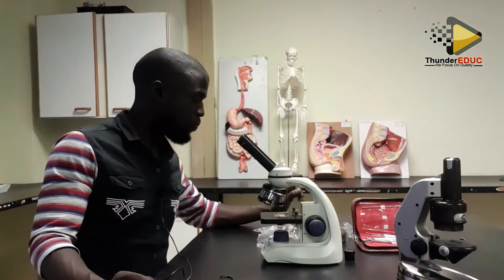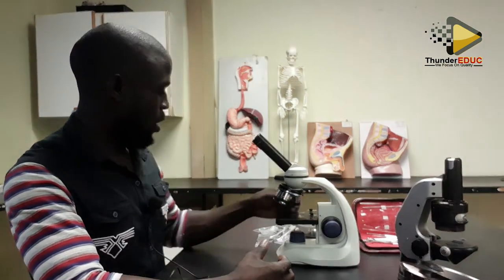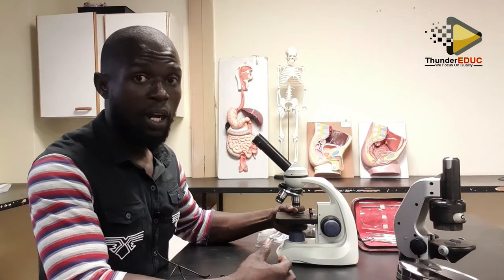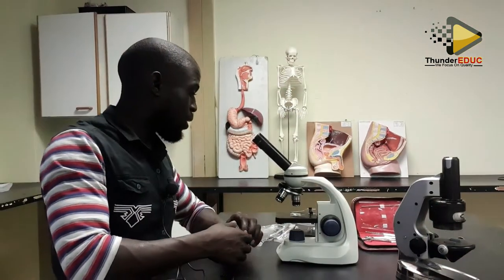In most cases, they are moving organisms. Now, how do I put an object on the slide? How do I dye it? How do I calculate the magnification? When you are calculating magnification, you multiply this times this. Note this, the one which you are using to view. That and this give you the total magnification.